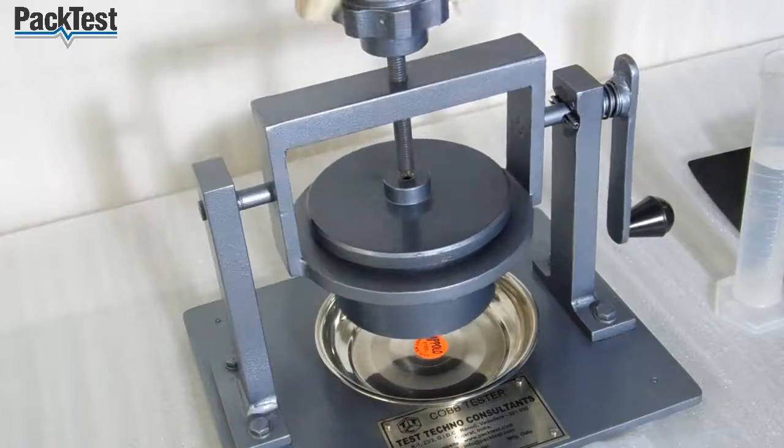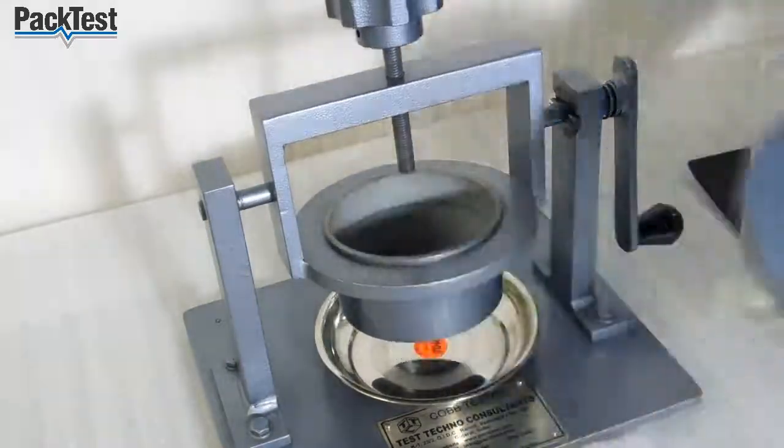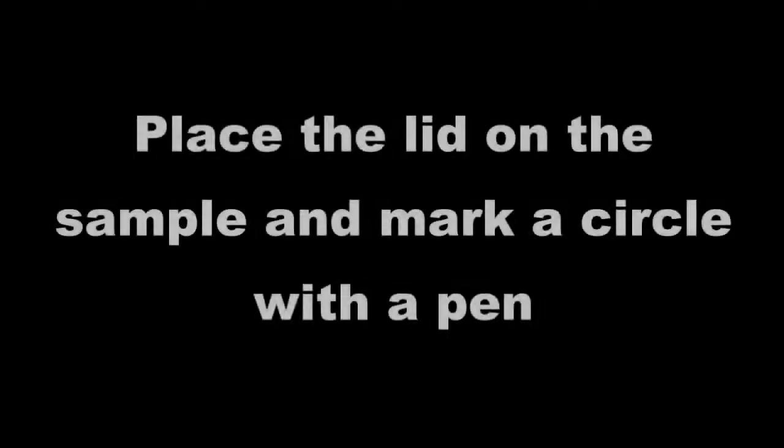This test can also be performed on corrugated board. Unscrew the lid and remove it from the machine. Place the lid on the sample and mark a circle with a pen.